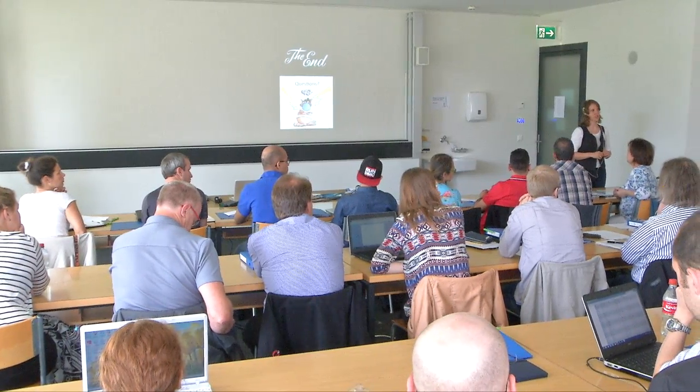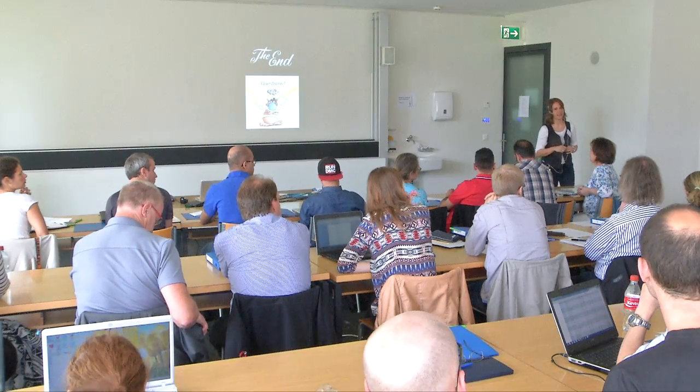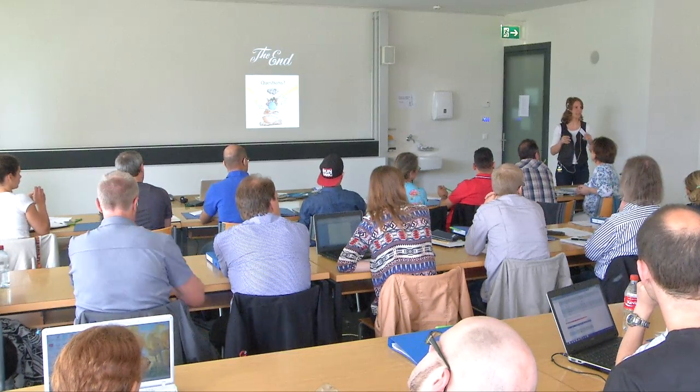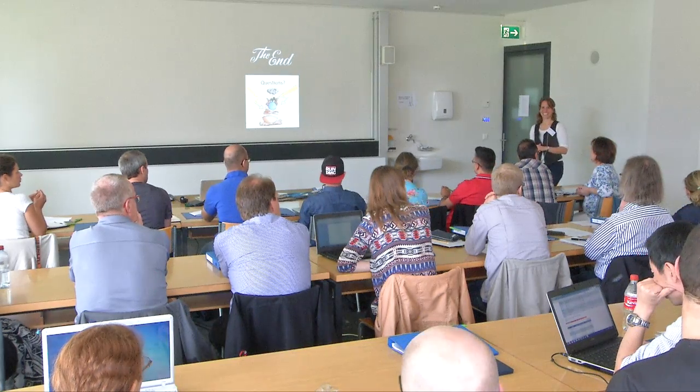It is a very good question, and I will just refer to Ariel. So this afternoon you will have another whole lecture just on how to set up the assays, and then there will come collision energies a lot more, and iRT and retention time prediction. And it's not always the same between all devices, unfortunately.